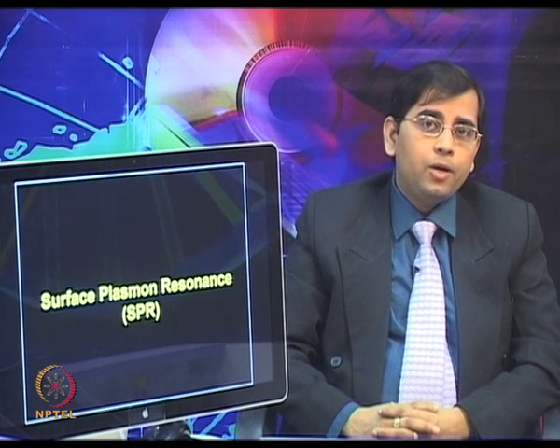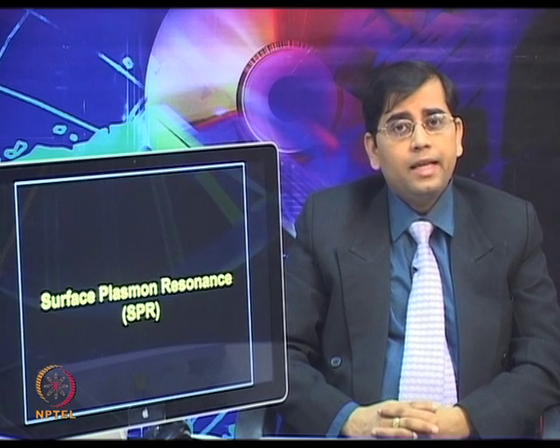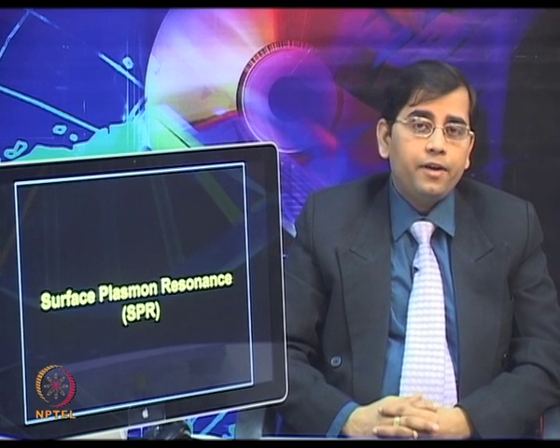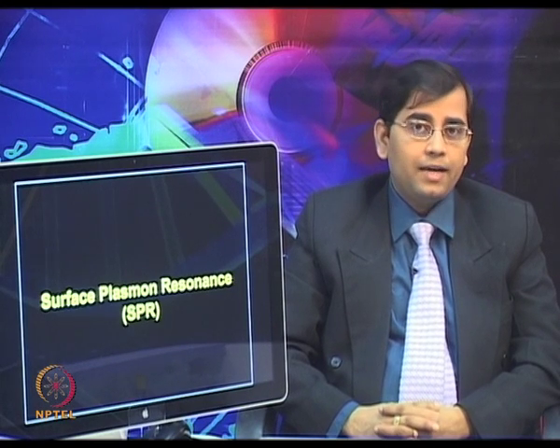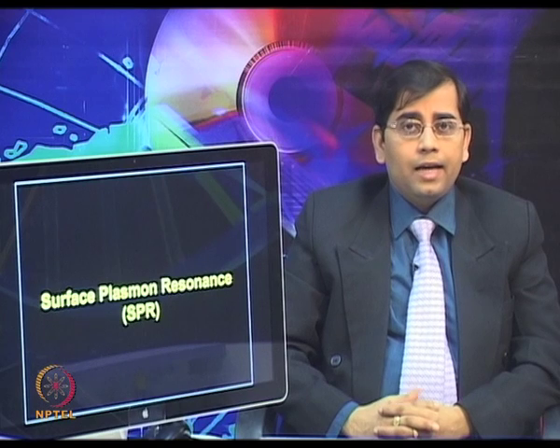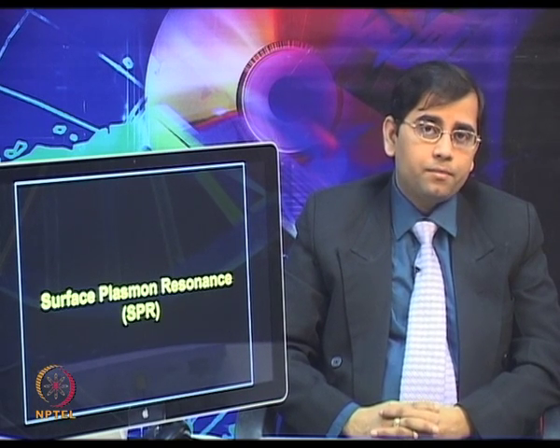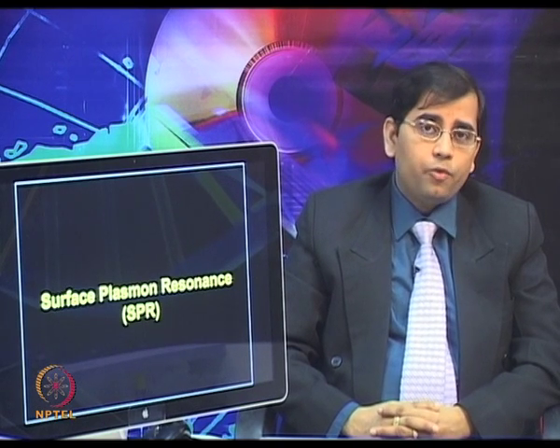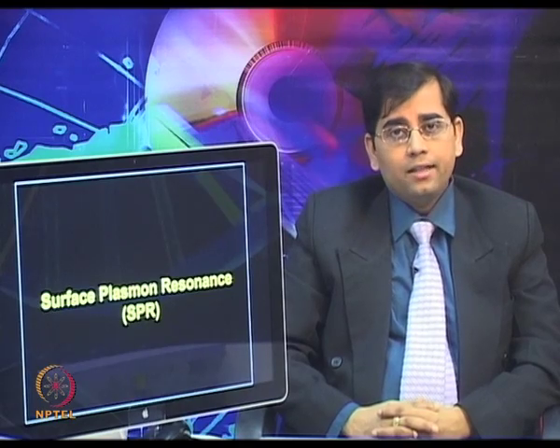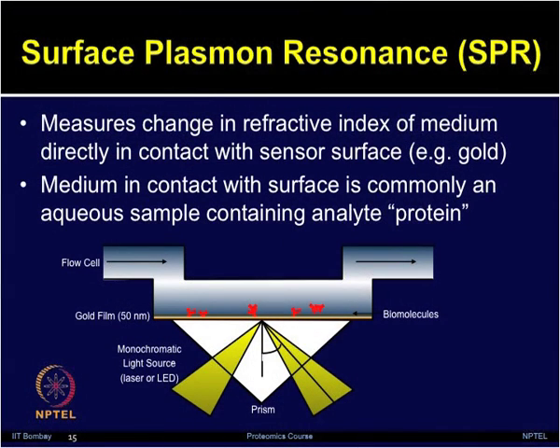The SPR based biosensors are in great demand because they can provide label-free real-time detection of various biomolecular interactions. SPR has been used for various applications in biology, including drug discovery, rapid diagnosis and security applications. So, let us discuss what SPR is.